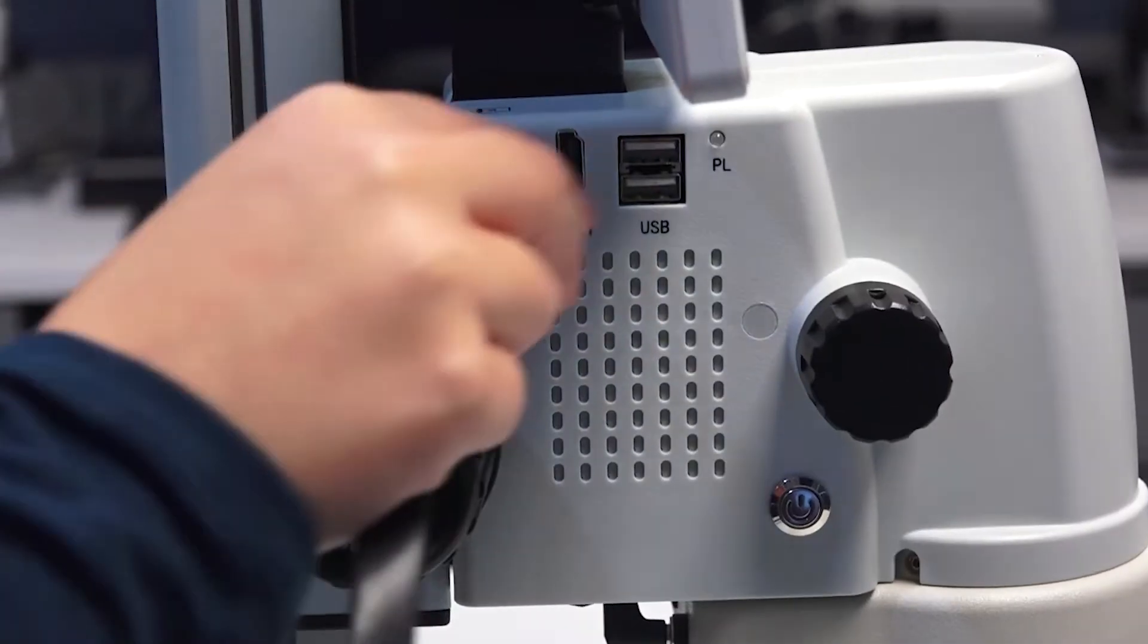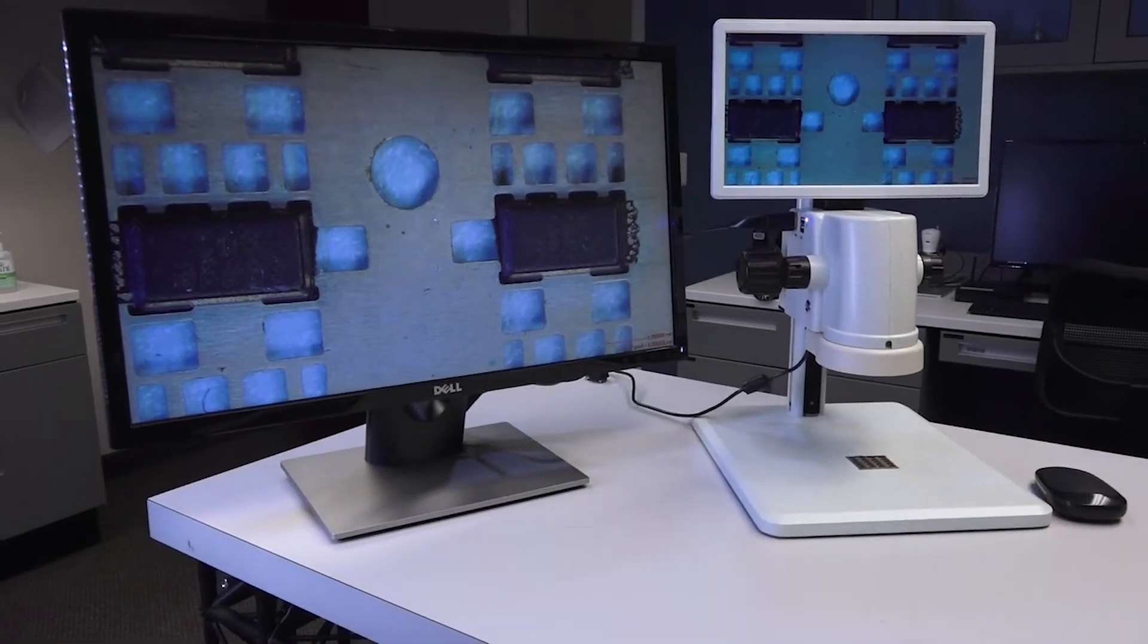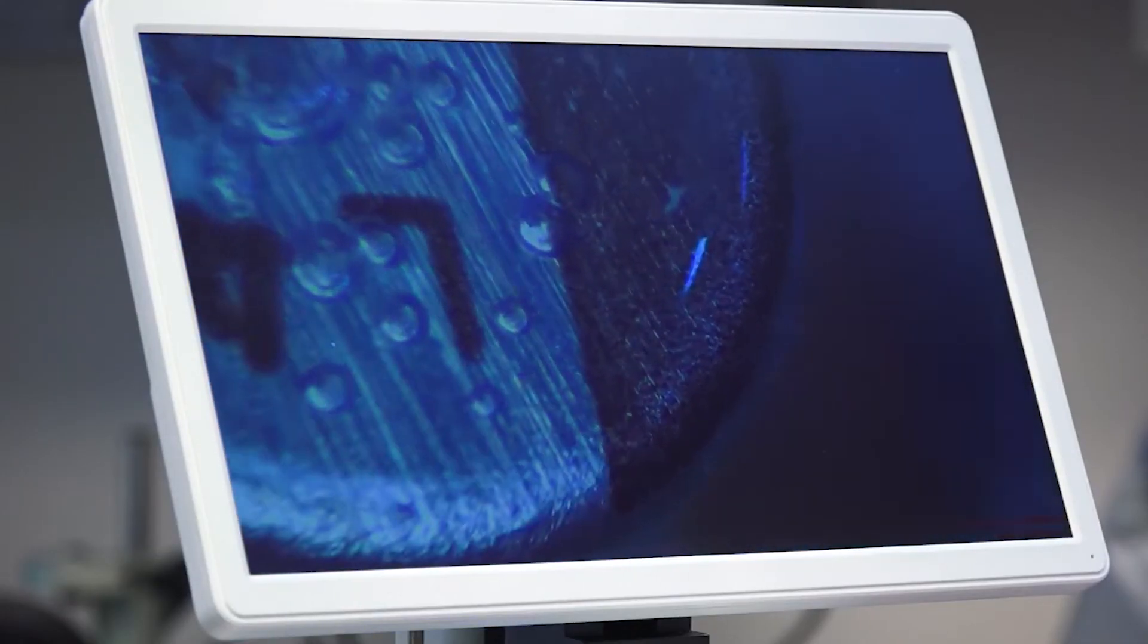The MicroView also features an HDMI output for viewing images on an external monitor. Optical magnification is adjusted using the click-stop zoom knobs on the side of the device.